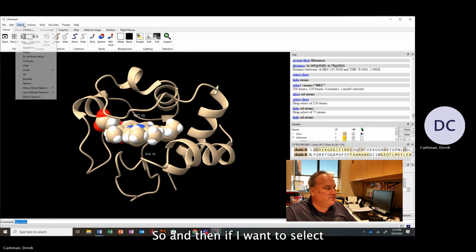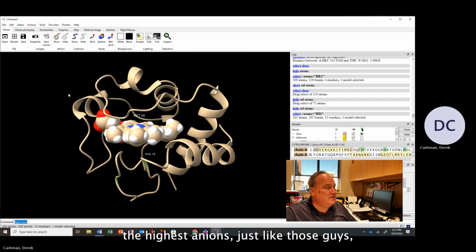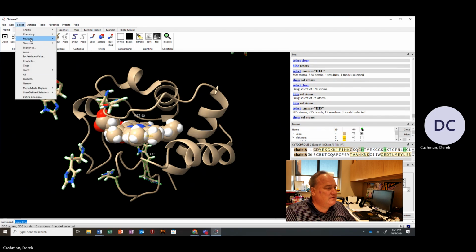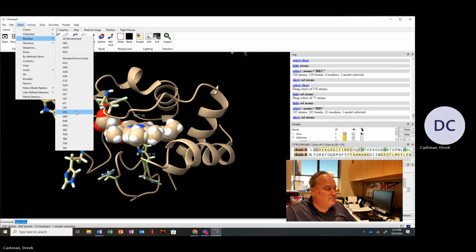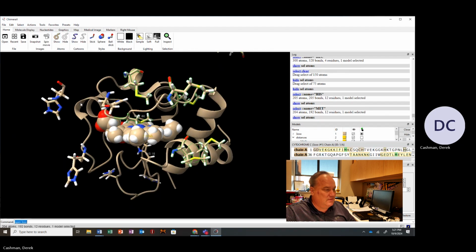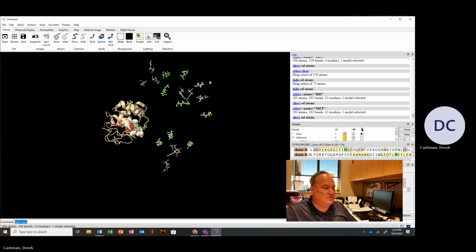So, and then if I want to select the histidines, select those guys. And then if I want to select the methionines, I'll select them again. And then I've got a whole bunch of others out here.